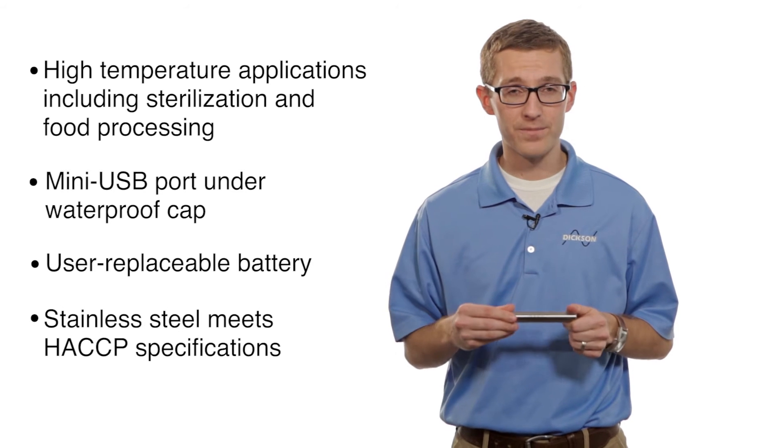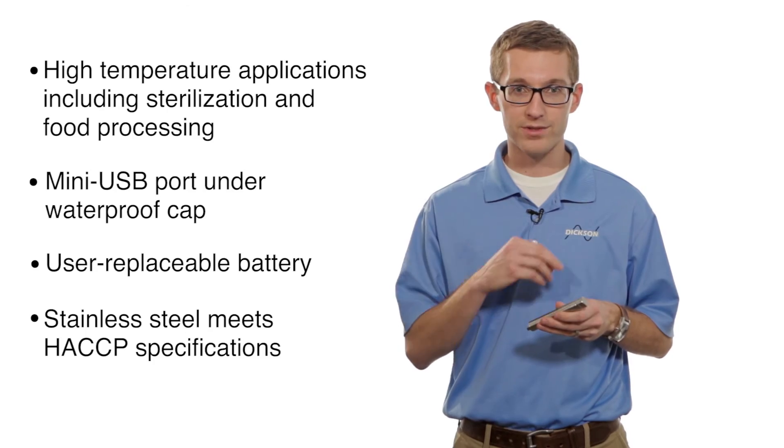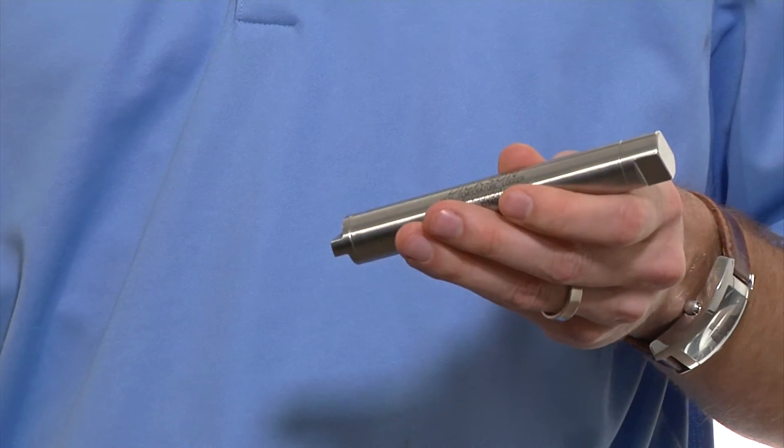It is stainless steel, so if you have to meet HACCP regulations, you can wash it down, you can wipe it off, you can sterilize it if you have a couple of different cycles.